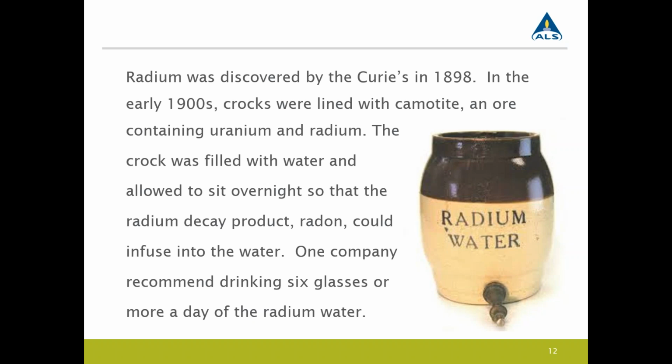Here's another question. Are there industries other than oil and gas from which you commonly receive samples, landfills, mines, etc.? Well, most of the samples that we do receive, like I said, we do a lot of oil and gas waste that are going to a landfill. There may be metal scrap recycling. A truck may go to a landfill and set off one of the detectors at the landfill. Building demolitions, especially at national lab sites or ore mining process sites. A lot of mining tailings. And monitoring of wells that are associated with mining or oil and gas industry. You see a lot of operators that have to do quarterly or yearly monitoring of wells within a certain radius of these sites.